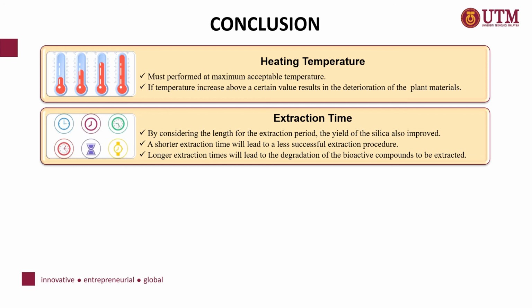The results from the previous study show that, by considering the length of the extraction period, the yield of the amorphous silica also improved. A shorter extraction time will lead to a less successful extraction procedure, whereas longer extraction times will lead to the degradation of the bioactive compounds to be extracted.